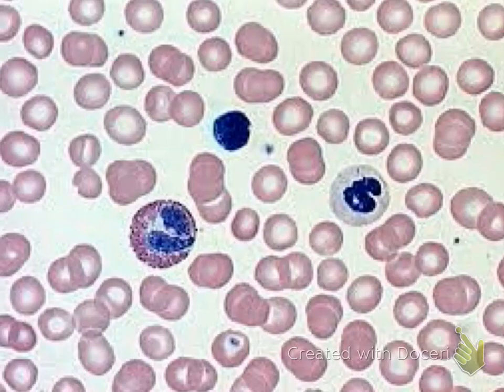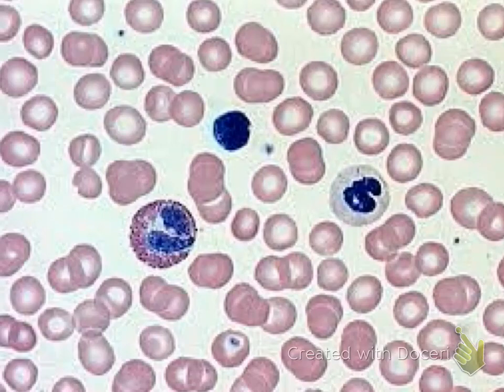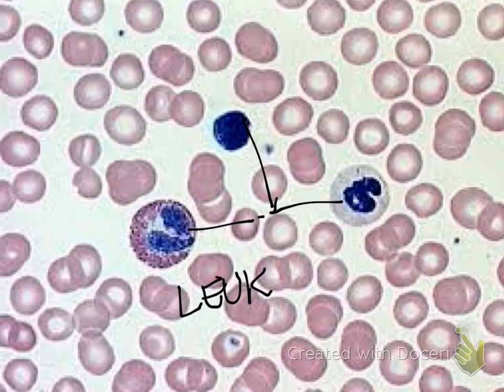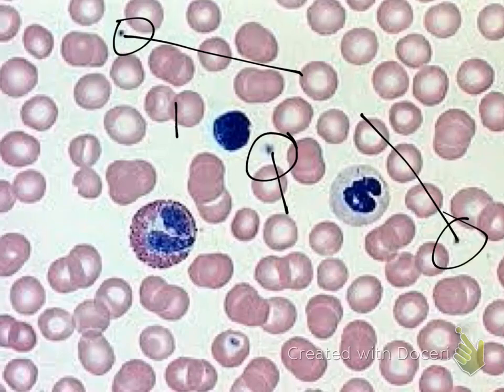The first thing you notice about this tissue are these red disc-shaped structures. These are your erythrocytes. When you see these red blood cells, you are looking at blood tissue. These blue-colored structures are your leukocytes, which are your white blood cells. These tiny little dots you see all around here are your platelets, which are involved in allowing your blood to clot.